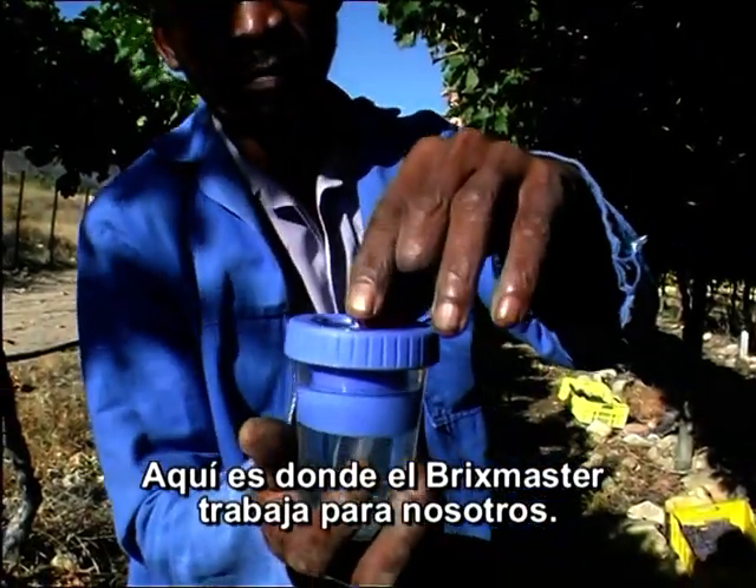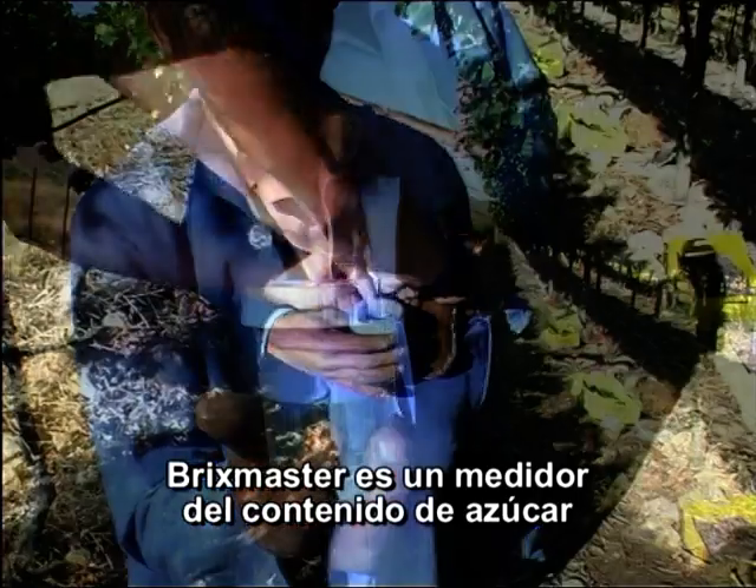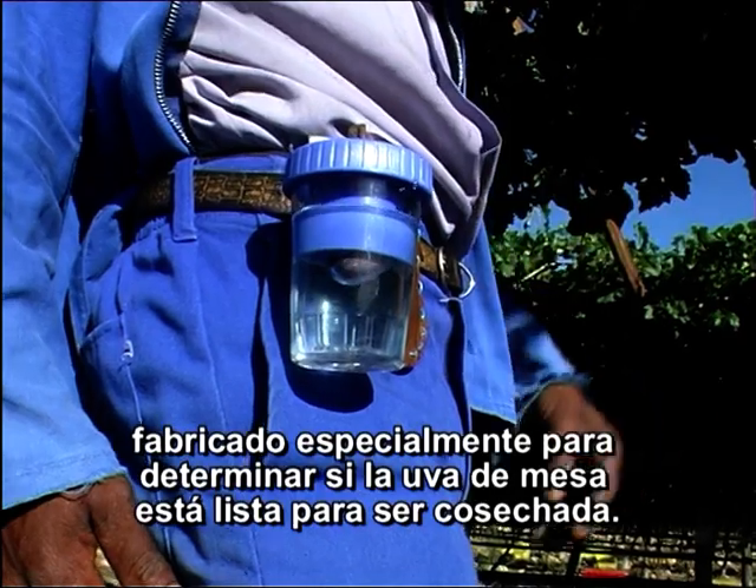This is when the Brixmaster is put to work. The Brixmaster is a sugar content meter especially made to be used on table grapes to determine if grapes are ready to be harvested.